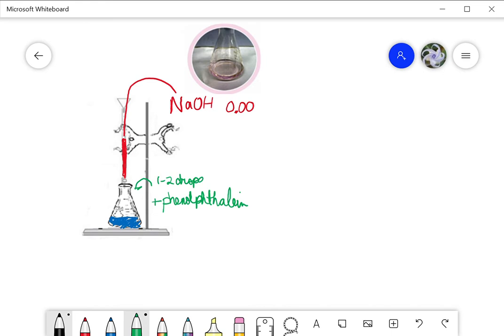This solution will actually be colorless when we first start. Remember, phenolphthalein is an acid-base indicator, so when we have just the smallest amount of base left over, it will be this color pink. And you want to make it as pale pink as possible—no dark pink. If it's dark pink, you have to start over.